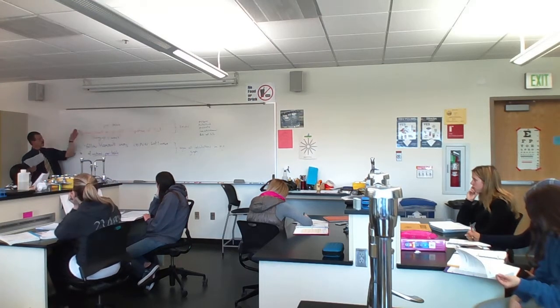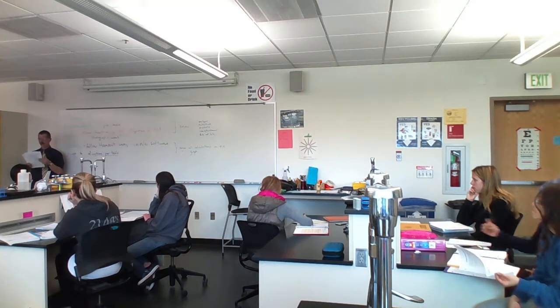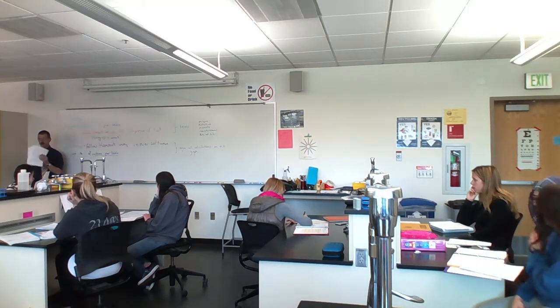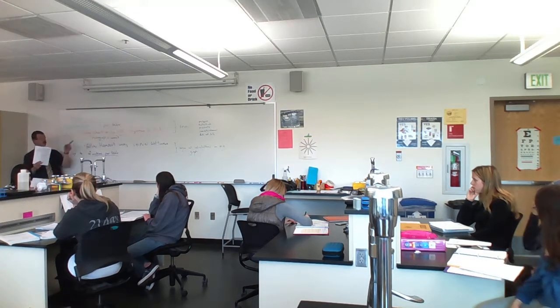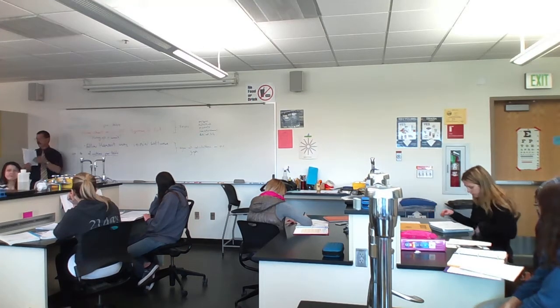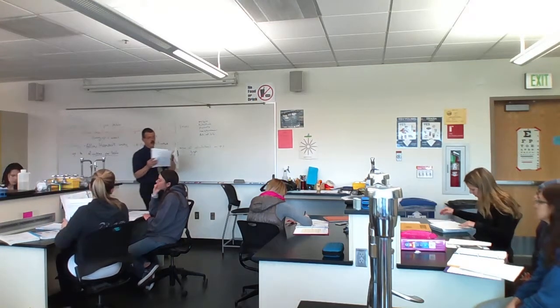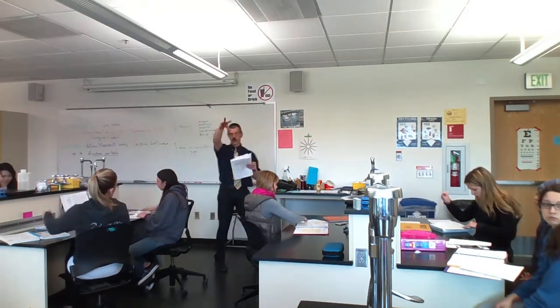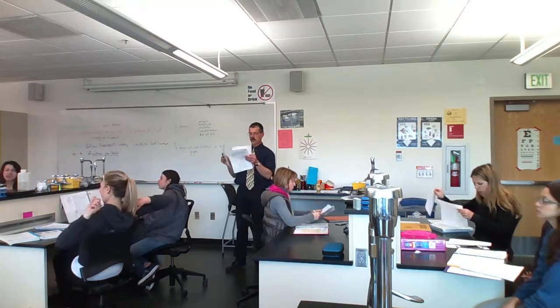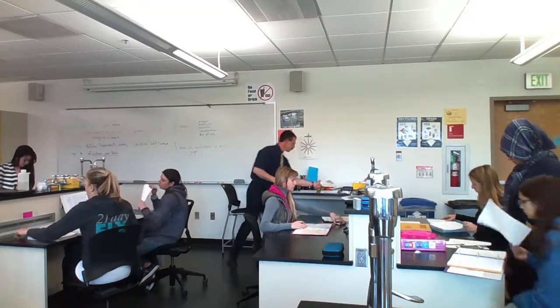For your lab quiz on this one, it'll be after we go over the data and interpret what happened in each tube and why. Again, there's no name and claim on next week's quiz. Make sense? All right, so I'm going to turn you loose. I would recommend you set this one up now with bubbling away while you're breathing into the tube and seeing how smoke will kill you. Right? But that's your call. So 1 per team is what you're doing for test tubes, 1 per team or 2 per team for the spirometry. And then when you're done, you're done.